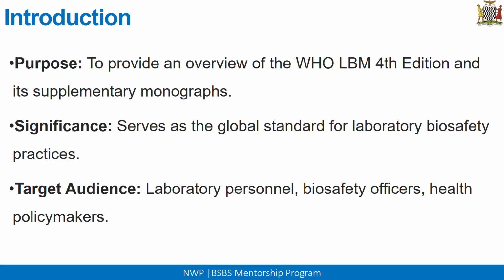So what is the Laboratory Biosafety Manual? The purpose is to provide an overview of the WHO Laboratory Biosafety Manual 4th edition and its supplementary monographs. So that's the whole essence of this particular section.